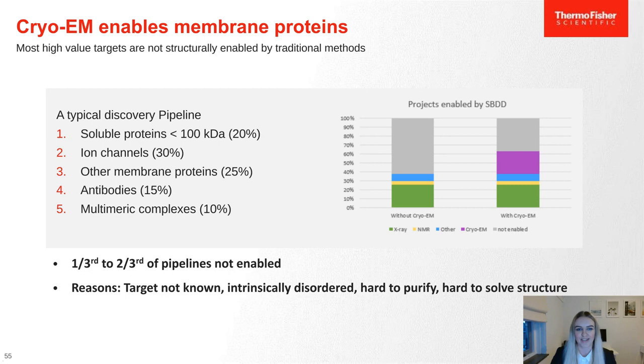Cryo-EM does not require crystals and can deal with some degree of sample heterogeneity. So this technique is well suited for determining structures of membrane proteins. And by using cryo-EM, we can increase the percentage of pipelines that can benefit from structure-based drug design.